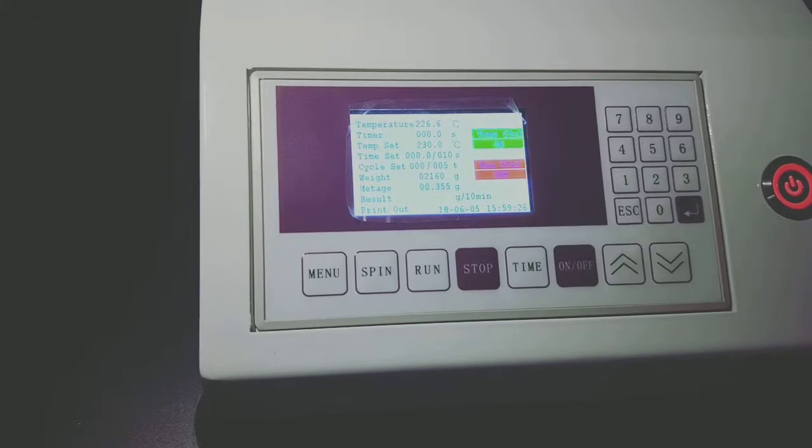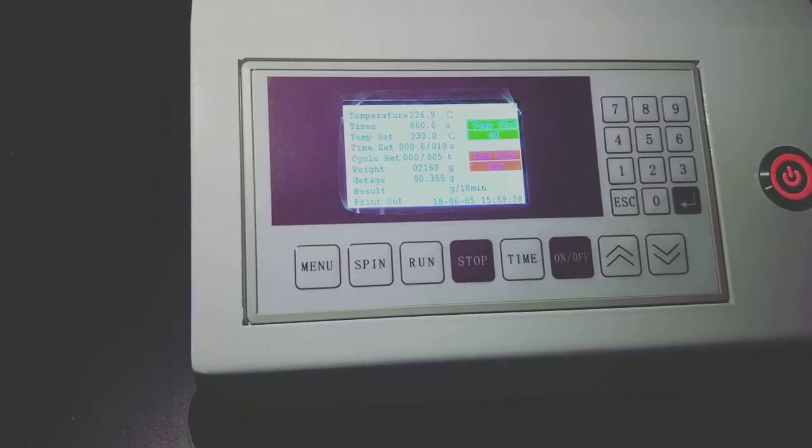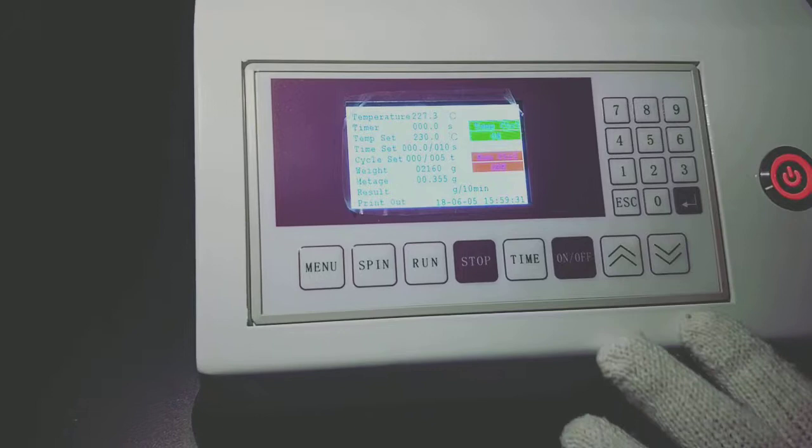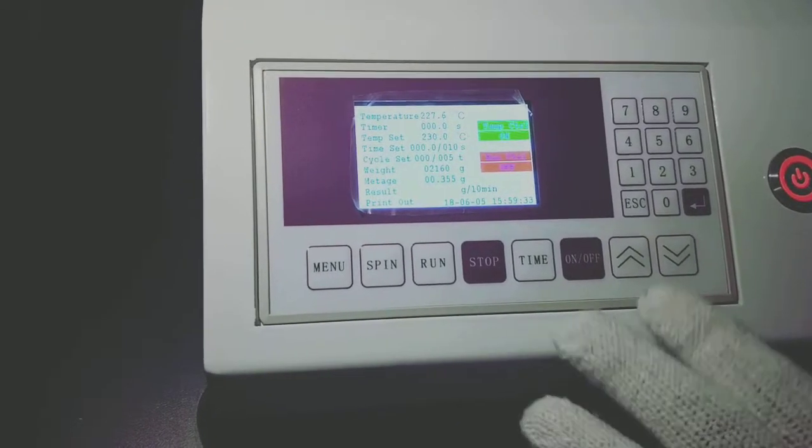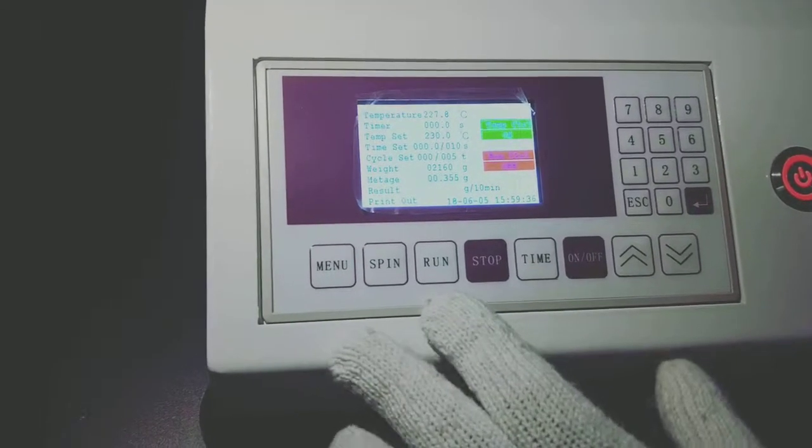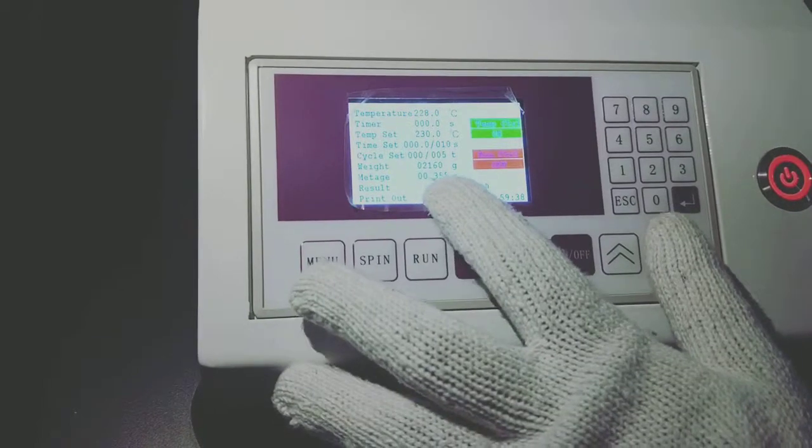For example, we cut five pieces of sample. Then we measure the five pieces weight and calculate the average weight of each piece. And then input the average value here.